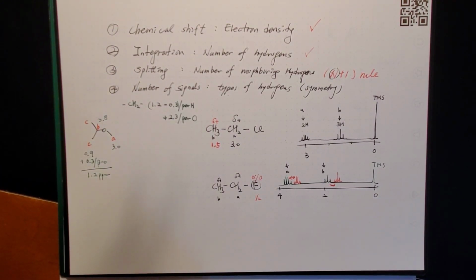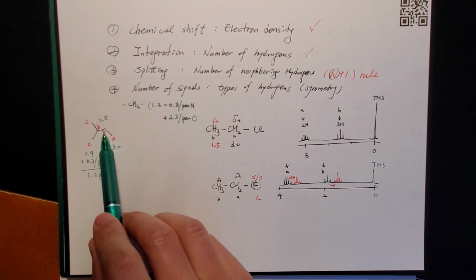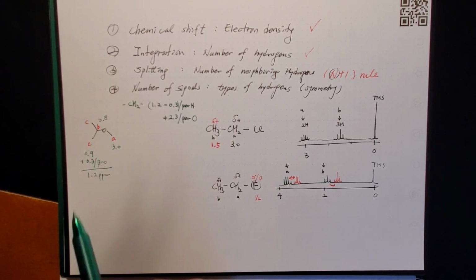But if you have a chlorine, bromine, you are adding here 0.6, twice more influence on the beta hydrogen, okay? Therefore, let's check our rough rule of thumb for the non-majors. If your alpha hydrogen is next to the oxygen, I say about 3.5. You see that? They're around the ballpark.